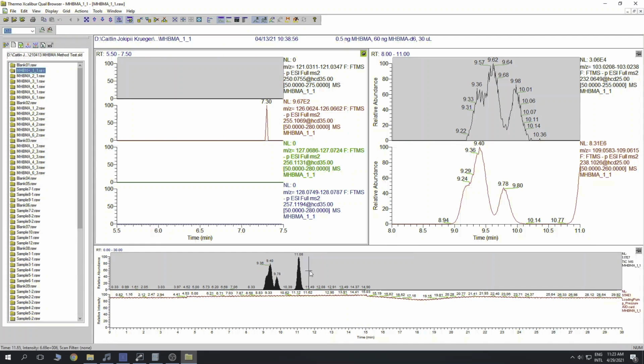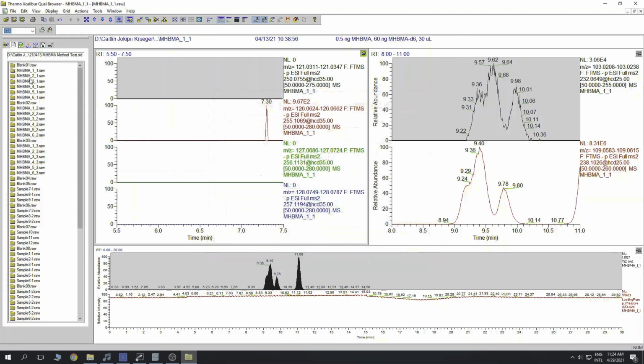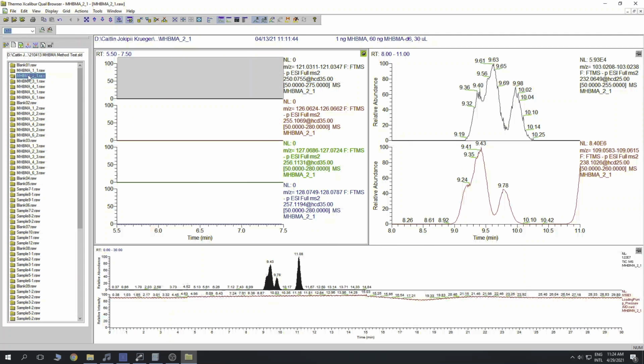And this layout is customizable for whatever you want to be able to look at when your sample analysis is finished. To do that, you'll right-click and select Ranges. And this will allow you to click the scan you're interested in looking at, the particular fragment ion you're interested in, as well as look at things like pressure or column oven temperature or any number of other metrics that the system collects while it's running. To open a different sample, you just click on a different sample name, and you can see what the sample looks like.